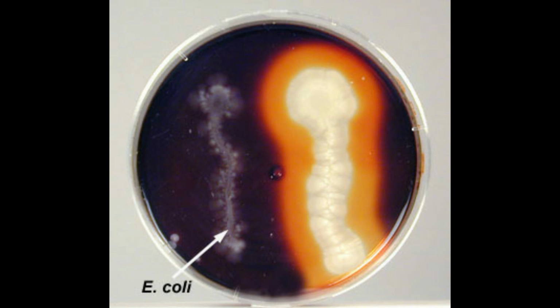The whole plate will turn blue-black except for the streaking area where the amylase positive bacteria are, and around that amylase positive bacteria, the whole area surrounding the bacterial colony will not be blue-black in color. The rest of the plate will be blue-black in color.